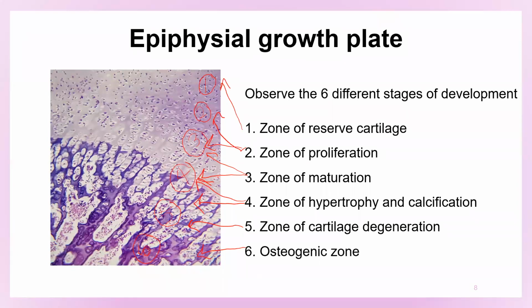Okay, really messed up. You didn't get confused, I hope? Are you okay with that? I put the arrows in the wrong places and I don't know how to get this off.